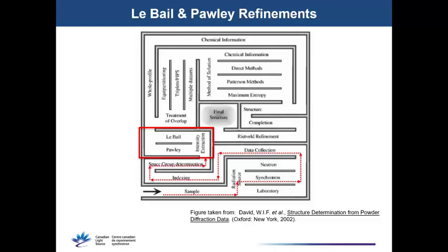Once you have a tentative unit cell and a space group with a volume that's compatible with the formula and the expected number of unit cell contents, the next step is to fit the data with a Lebail or a Pawley refinement and to see how well that unit cell actually describes your pattern. And often this step blends into the previous step. So what you'll do is you'll get a few different unit cells that look like they could be possibilities, and you try Lebail or Pawley refinements, and you compare and you see which one you believe is actually the very best fit.